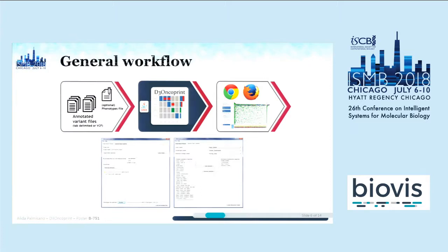And it takes files that are in common annotated variant formats, so either a VCF file, a tab-delimited file, or a MAF file, which are the files used for TCGA data, for example. And the point is, with just two visually pretty simple, click buttons and drop-down kind of thing, you can then generate an Oncoprint, which is created in a web browser, so it's all dynamic there.